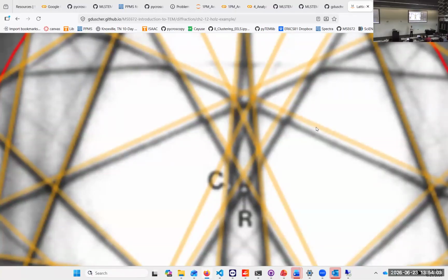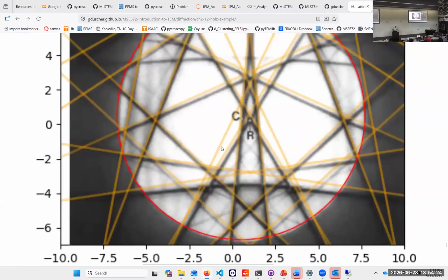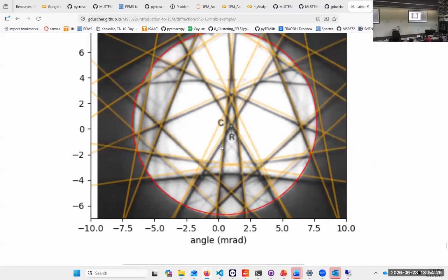So depending on your Young's modulus and how much stress is deforming your crystal, you can measure that down, in the case of silicon, to kilopascal deformation, and you can do that locally, and actually you get the full stress tensor out of that because you have to mesh all of them.